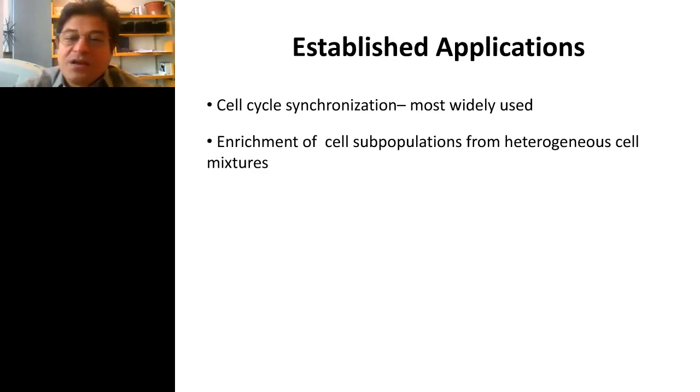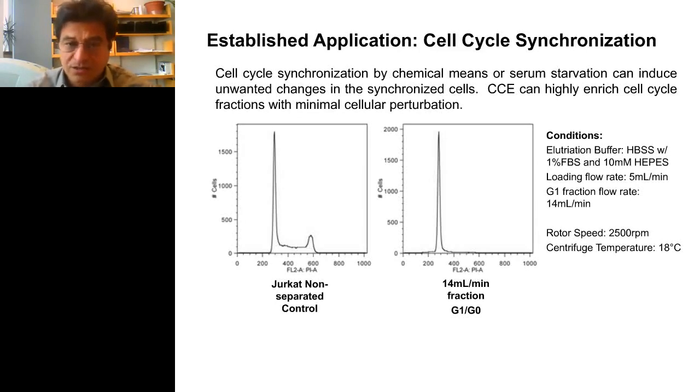Also, enrichment of cell subpopulations from a cell mixture is widely done. Monocyte purification is widely performed also. So these are existing applications that can easily be plugged into a core environment. So just to show you a couple of examples out of our lab.